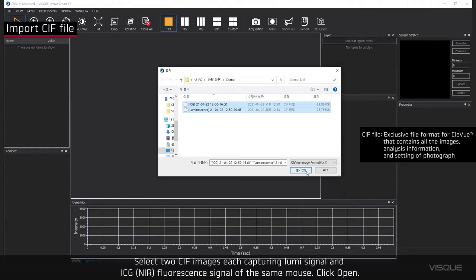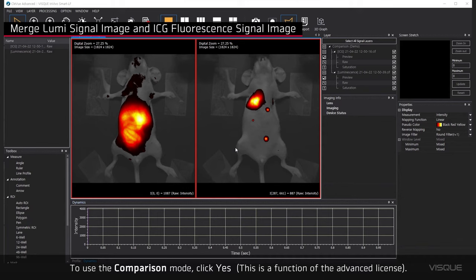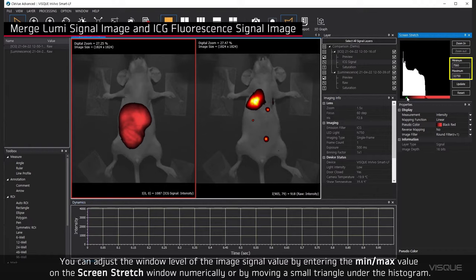To use a comparison mode, click Yes. You can adjust the window level of the image signal value by entering the minimum or maximum value on the screen stretch window numerically or by moving a small triangle under the histogram.